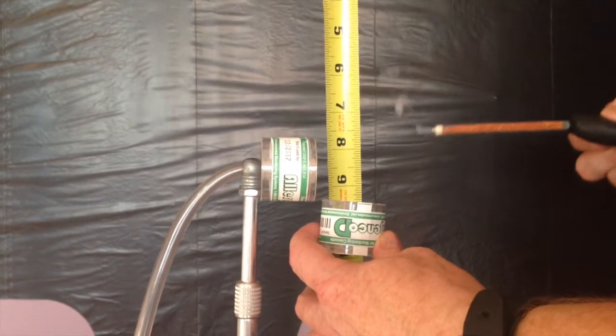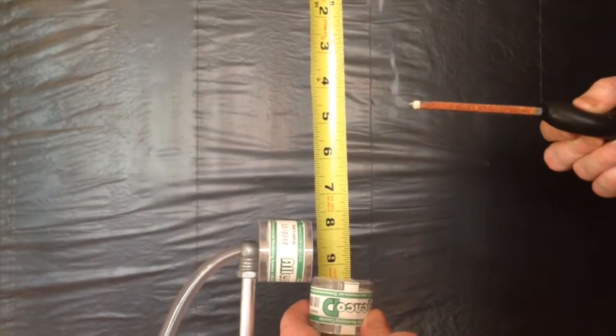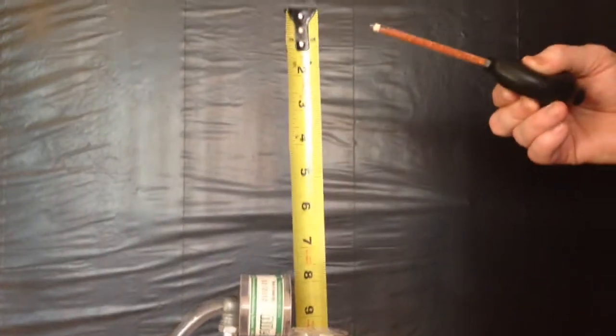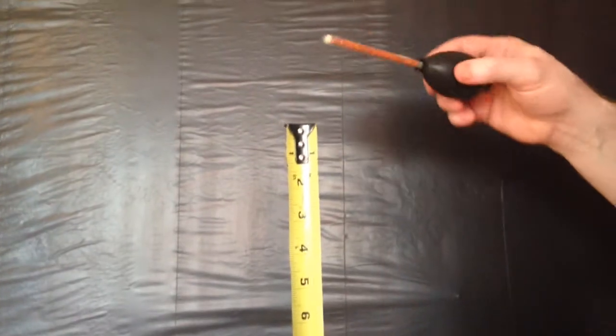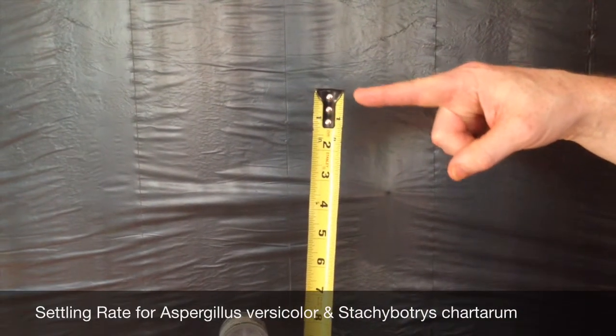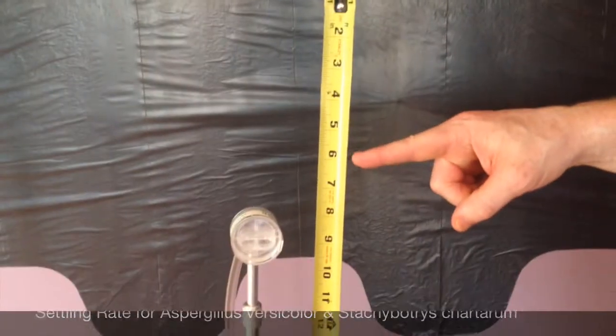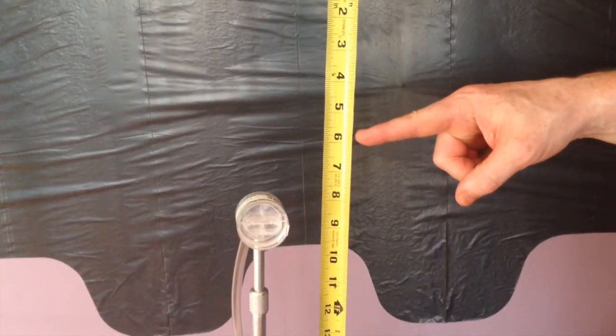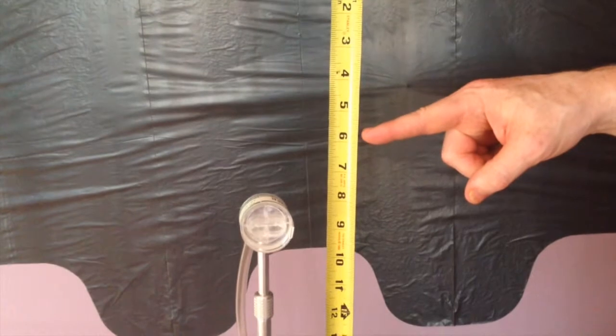The Stachybotrys chartarum conidia would settle from this location in five minutes. The Aspergillus versicolor conidia would settle from this location in five minutes. The average spore trap air sample lasts five minutes.